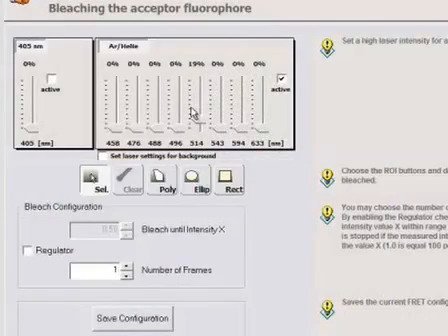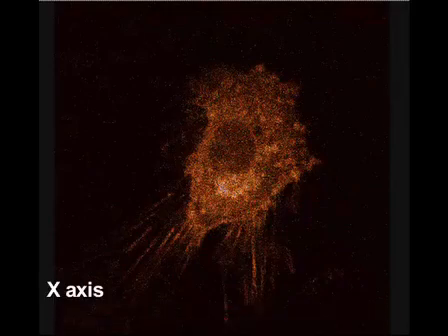For photodestruction of the acceptor, adjust the AOTF to 100% at 514 nanometers and allow the laser bleaching to continue until 70% of the YFP emission has been depleted. To accelerate bleaching, ROIs are typically chosen in the raster axis of the laser.